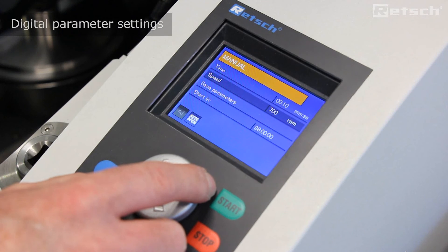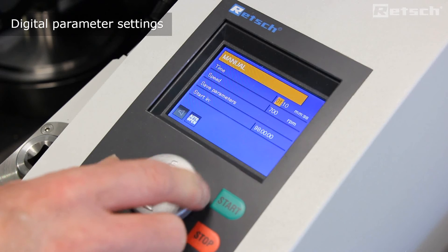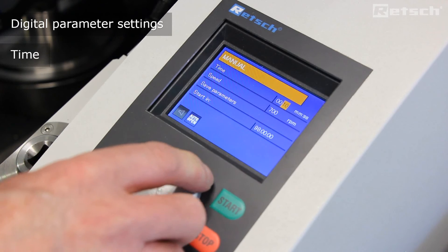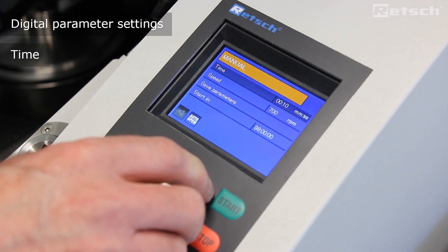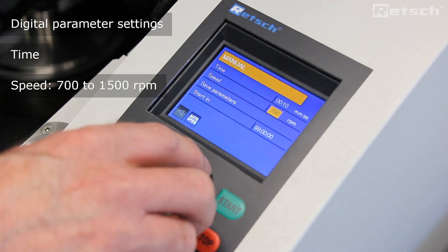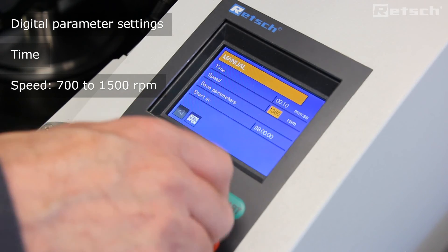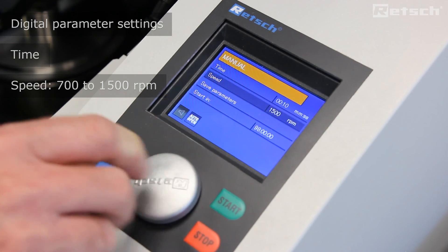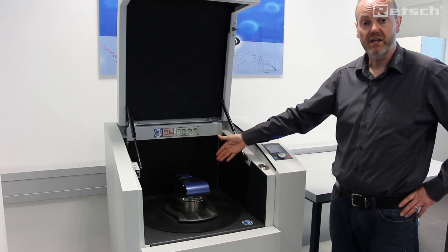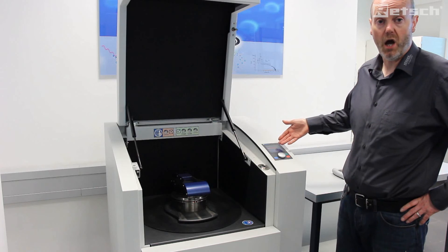On the color LCD display in manual mode, we simply set the time, either in minutes or seconds, and set the speed, which is freely adjustable for the grinding sets outside of agate and tungsten carbide from a minimum of 700 rpm to a maximum of 1500 rpm. Once the grinding set has been securely clamped, we then simply set the parameters of time and speed on the display.